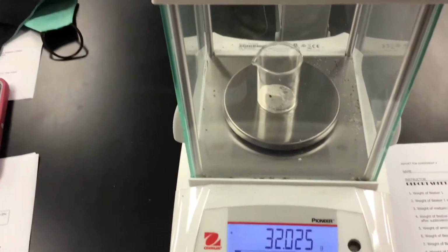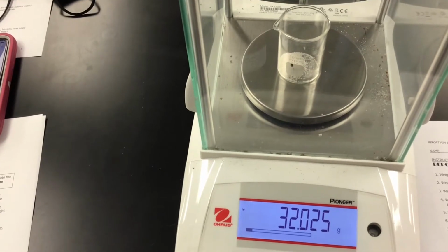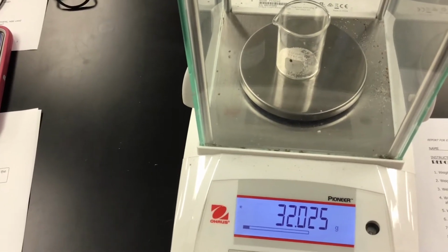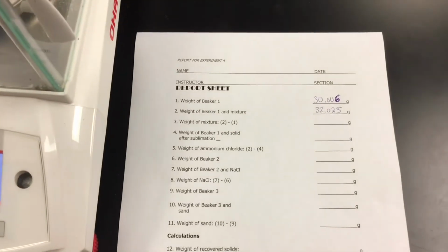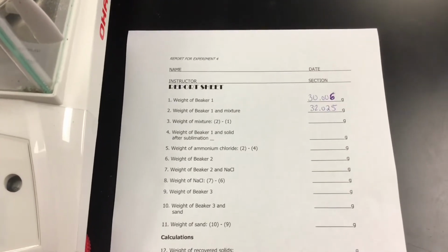I put that in there, and then my reading for the number 2 weight of my beaker and mixture is 32.025. So that is what I have. You guys can do the calculations.